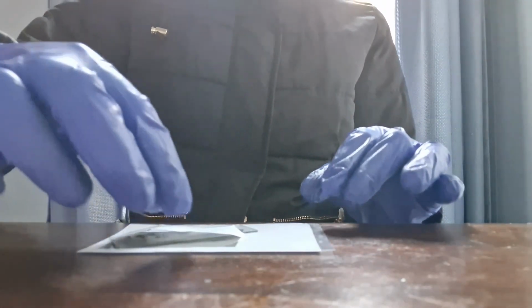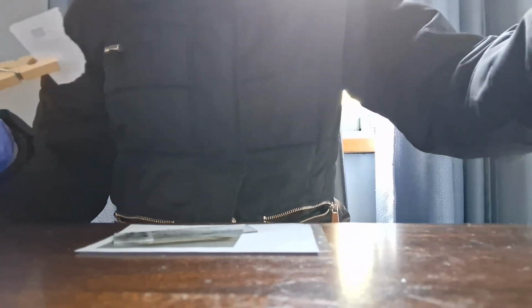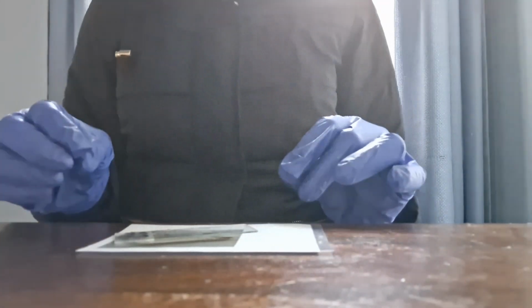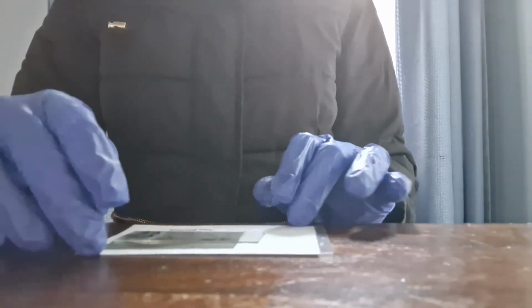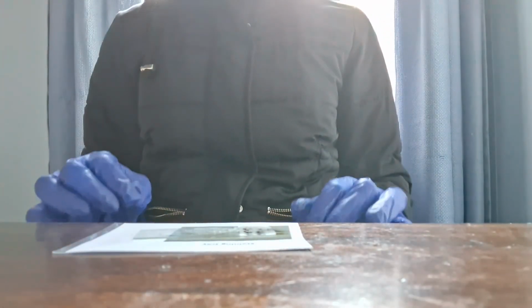Then I'm going to take the gloss paper off and put it in the biohazardous waste since I'm done using it. Then I'm going to let it sit for some time.